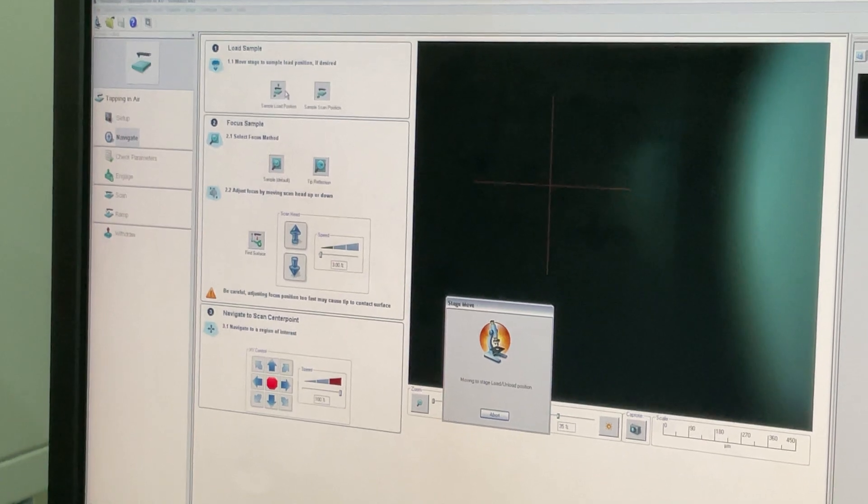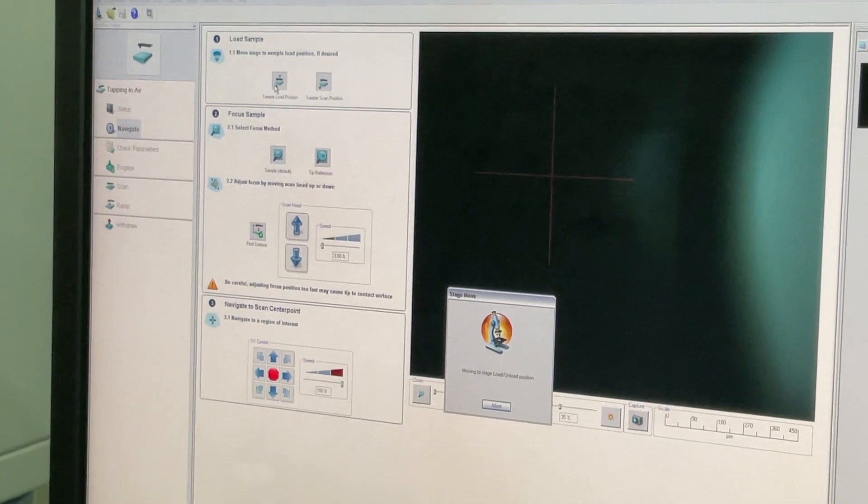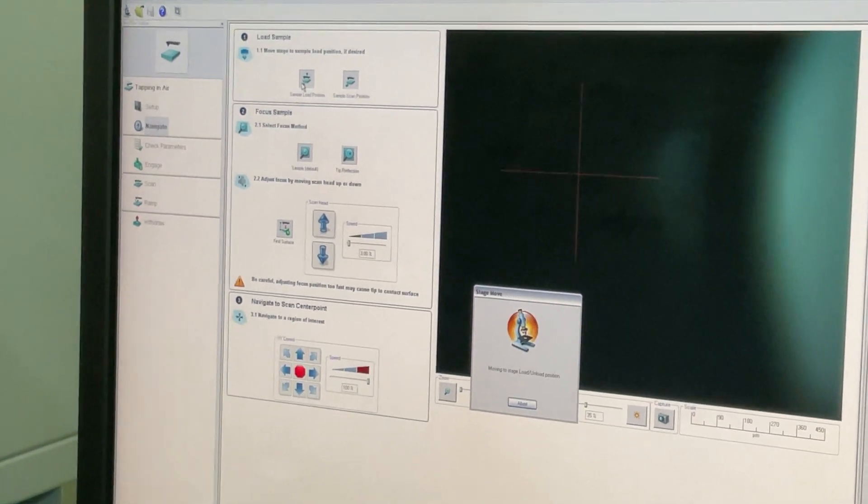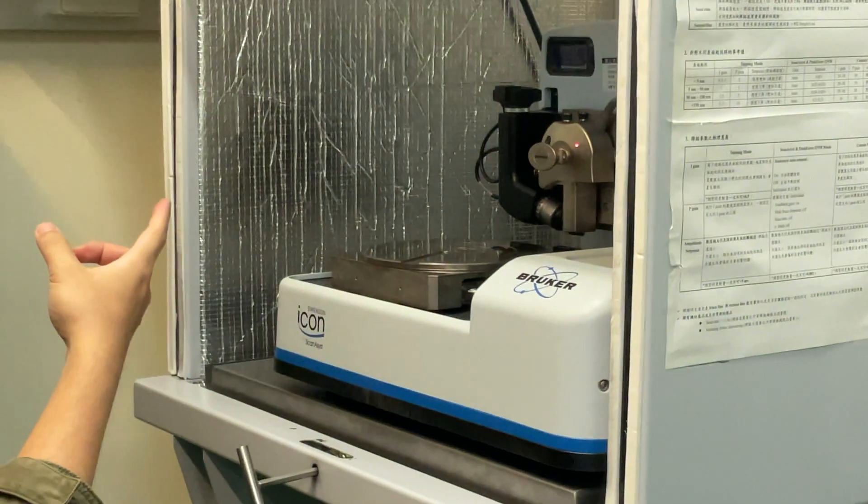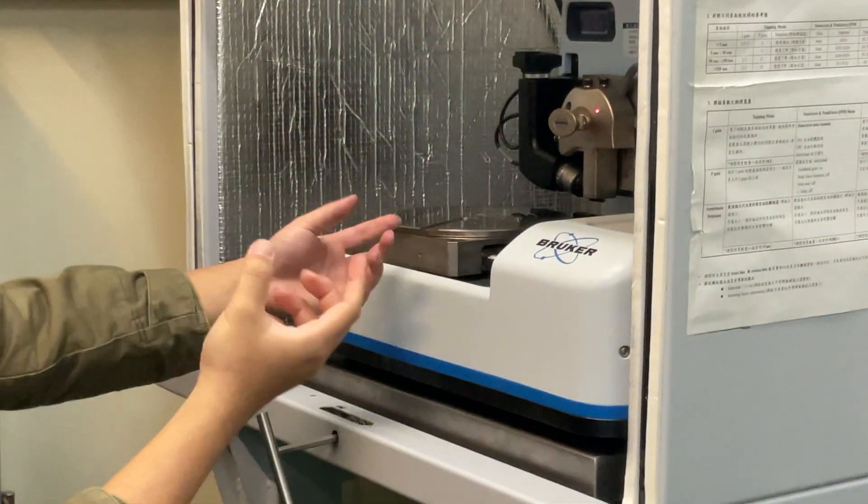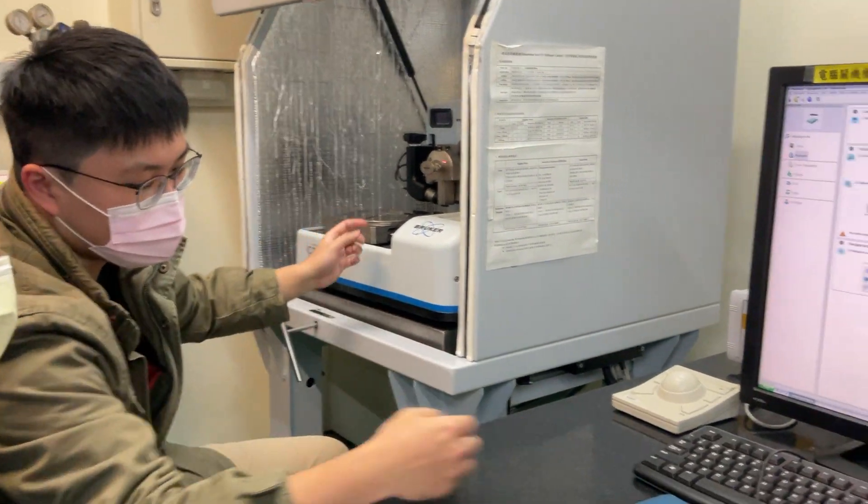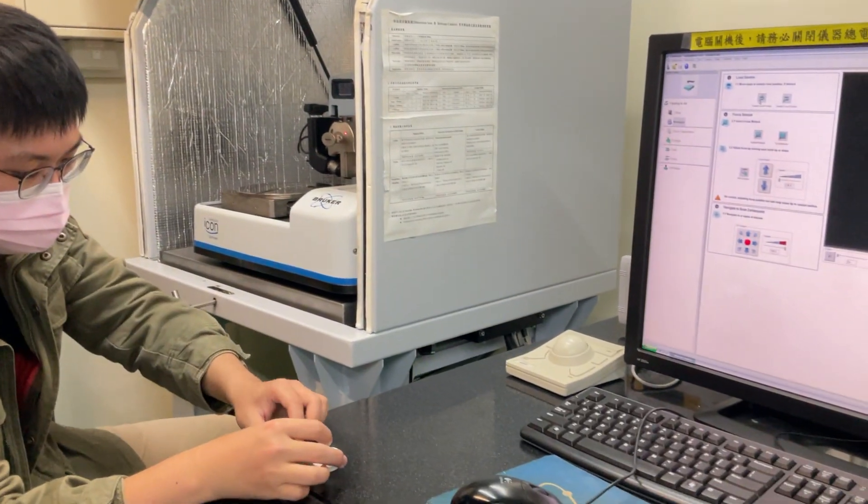And when we click this, we mean that our scan will go outside and the stage will also put our sample.